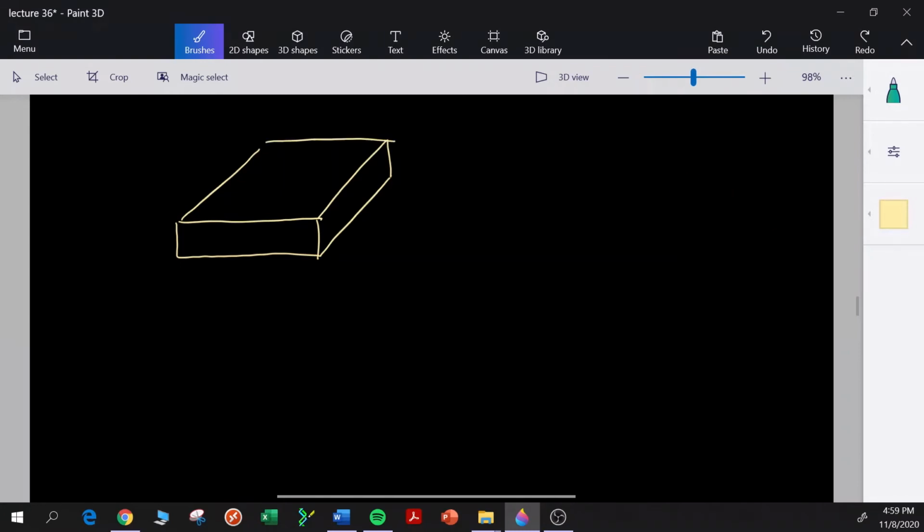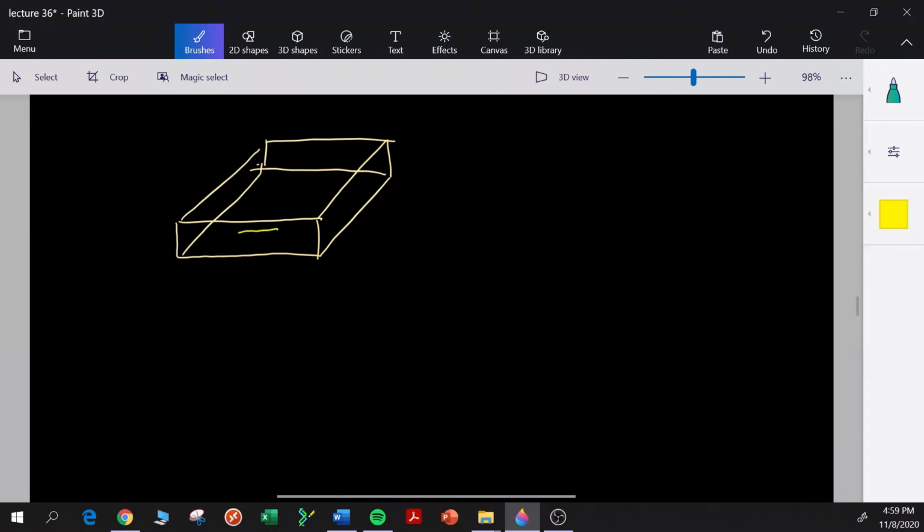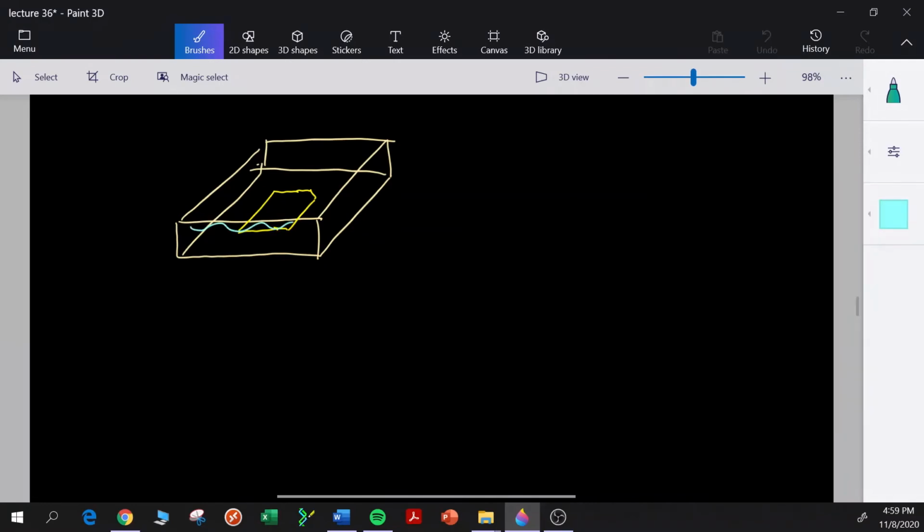Okay, so here's a tray. What we're going to do now is put our nylon membrane in this tray with what is called hybridization buffer. There's the buffer, it's this blue color, and the nylon membrane is submerged in the buffer. The buffer is going to allow our probe to hybridize to any complementary RNAs on the nylon membrane.